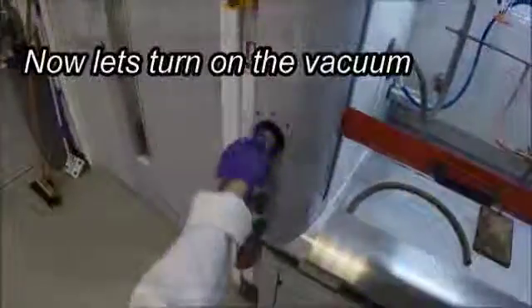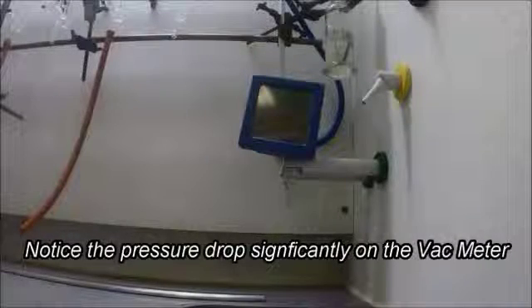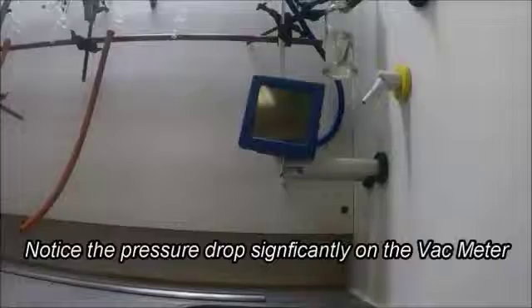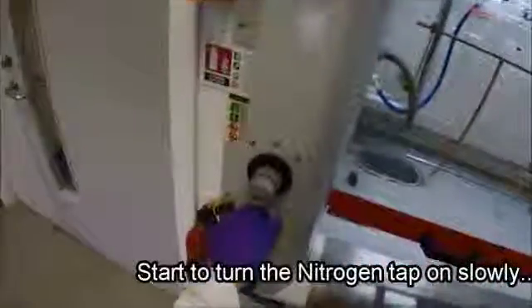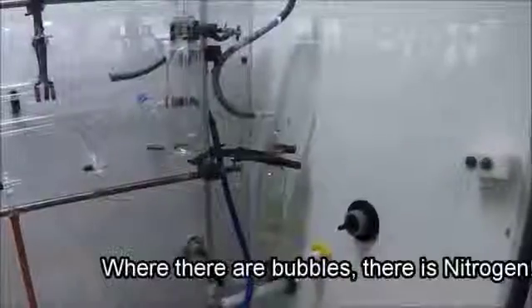As the vacuum turns on, you'll notice the pressure dropping significantly on the vac meter. When you see bubbles, that means nitrogen is flowing through the system.